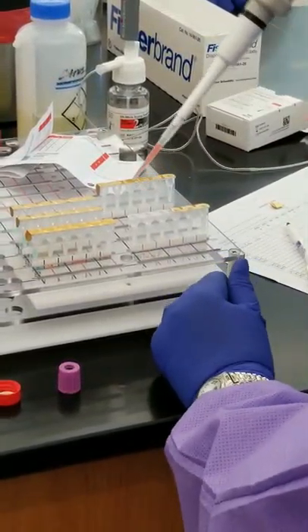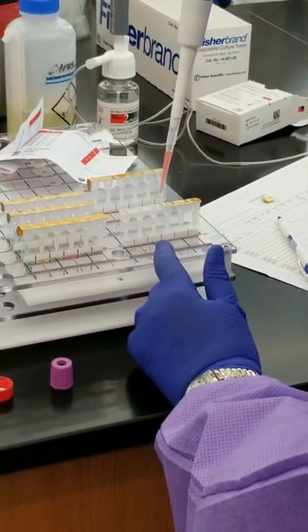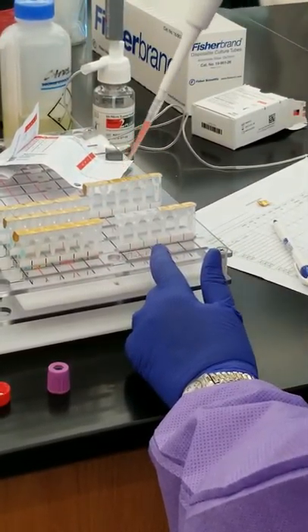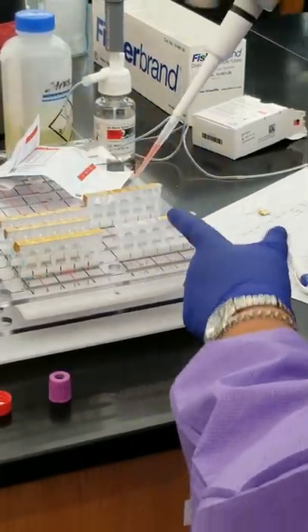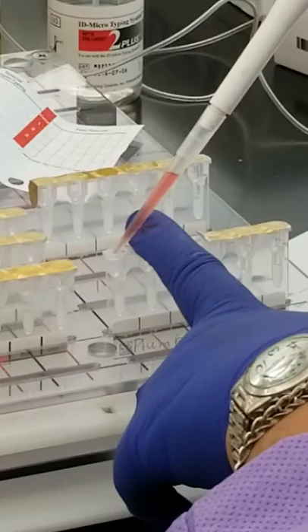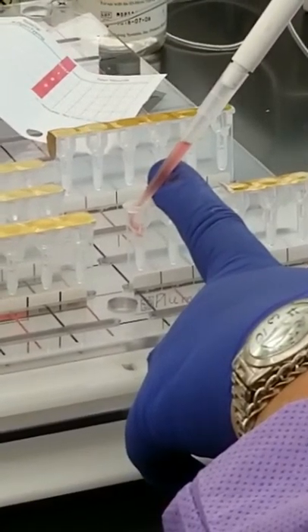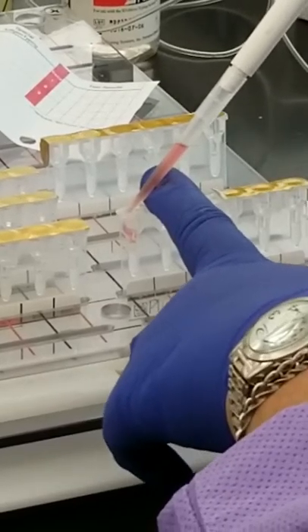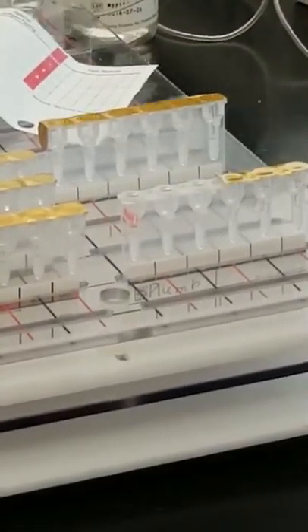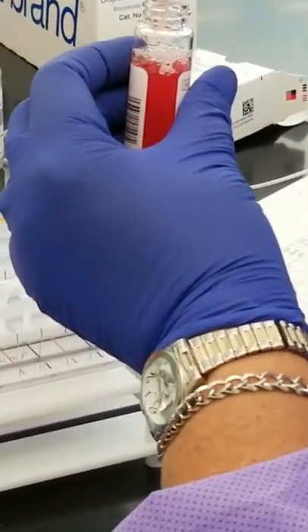What you want to do is you don't want to stick your pipette all the way in there and get it contaminated. And you don't want to hang out so high that you splash it everywhere. The easiest thing to do is put your finger over the other well, slide the tip down until it's just inside the micro well, and then dispense. Then, as long as you haven't contaminated the tip, you can run it back into the bottle. So let me show you, if I'm going to continue to dispense, there's your dead space.